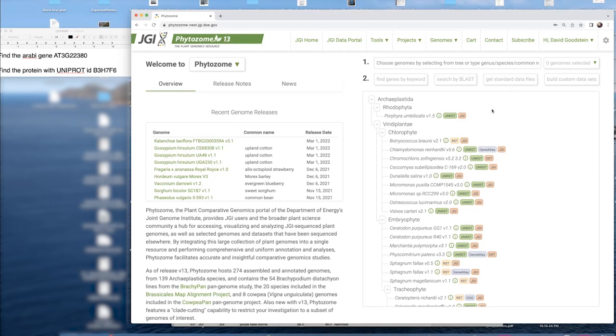And that is, typically what do we use these comparative websites for is we have interest in a particular organism and its genome, and it's probably not a model system, or if it's a model system, it's certainly a harder model system to work with than the old standbys like Arabidopsis. So what we're usually going to do is try to find the relevant genes in Arabidopsis and then start looking for the associated genes in the other organism.